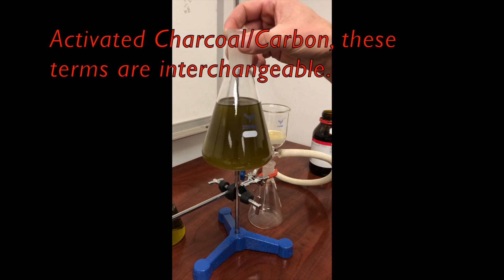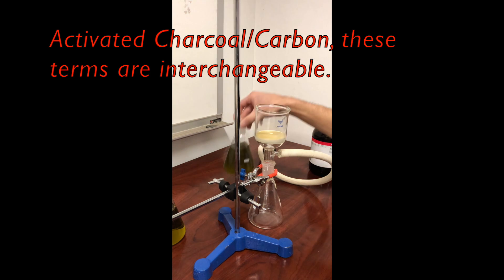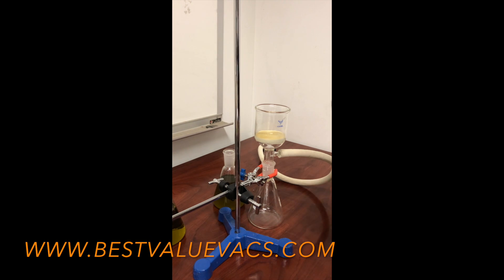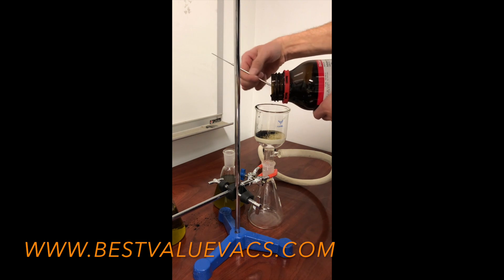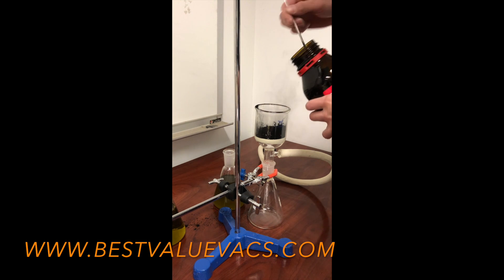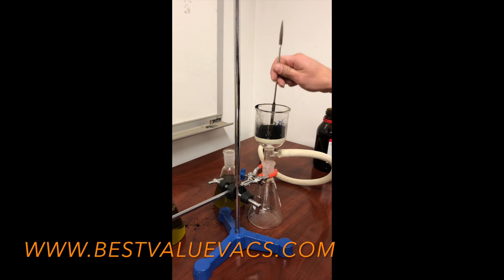This is again the same batch — we have an organic material mixed with an extracted alcohol. Now we're going to add some carbon to this and create a carbon layer in the funnel. I'm moving it around in the funnel and evening it out.